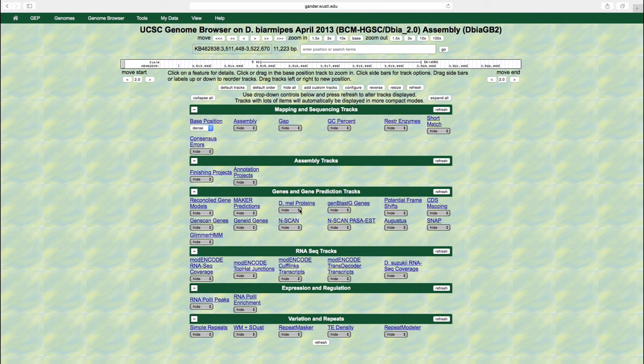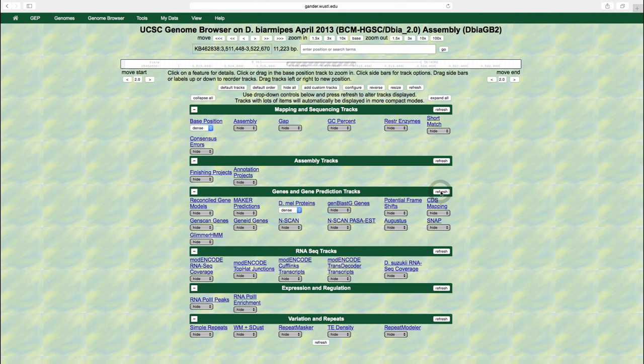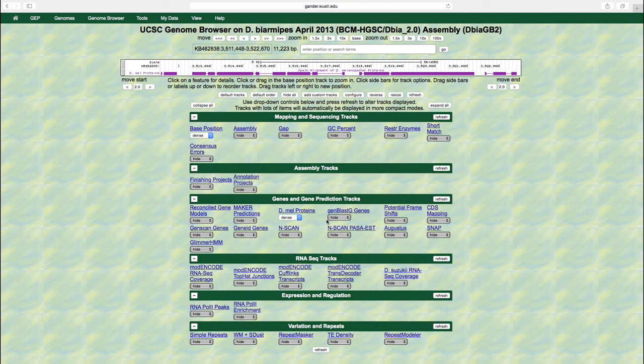Now we will change the display mode for the DML proteins track to dense, and then hit refresh. Dense means the selected track is displayed with all features collapsed into a single line, irrespective of whether there are overlapping features.